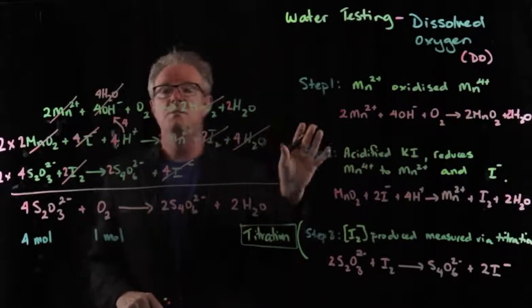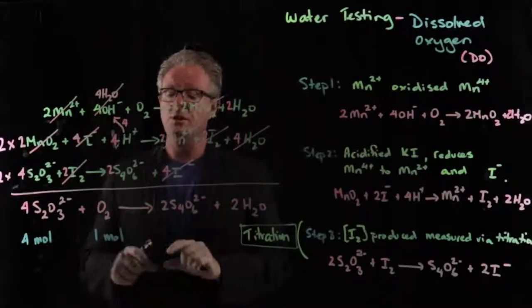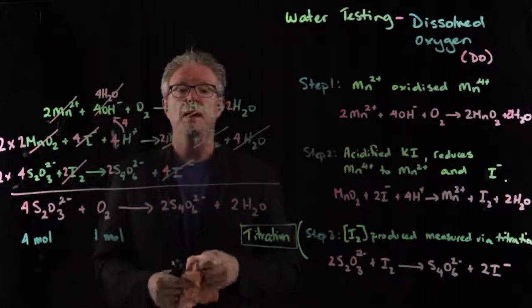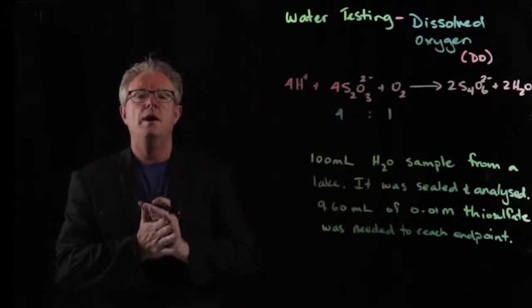Okay, we're going to write up some calculations and do a sample calculation, and we'll rewrite this so we can see the overall reaction. Be back in a minute. All right, and we're back now.